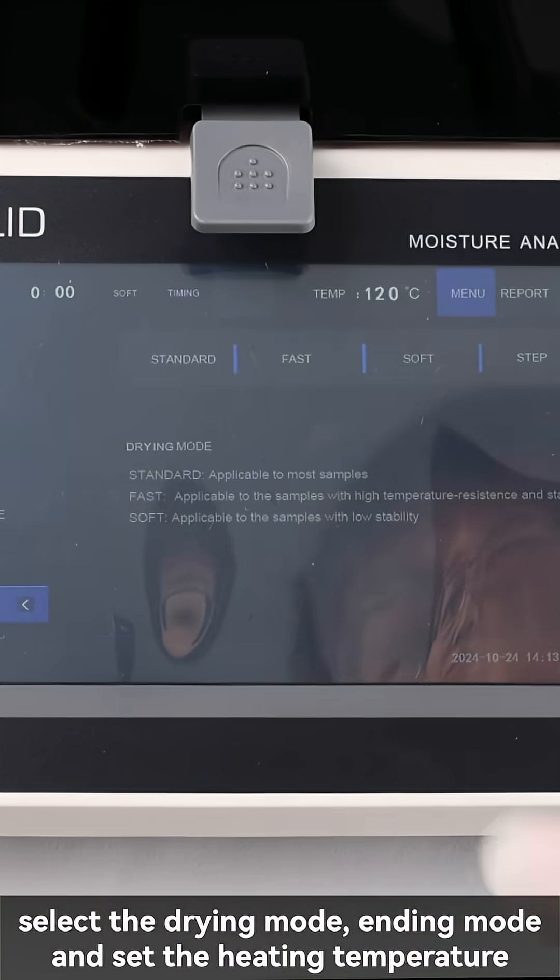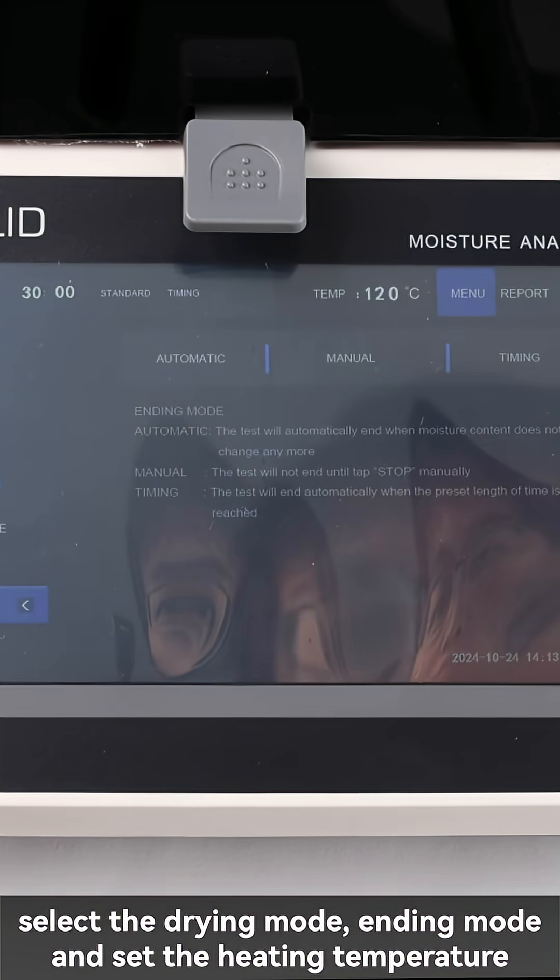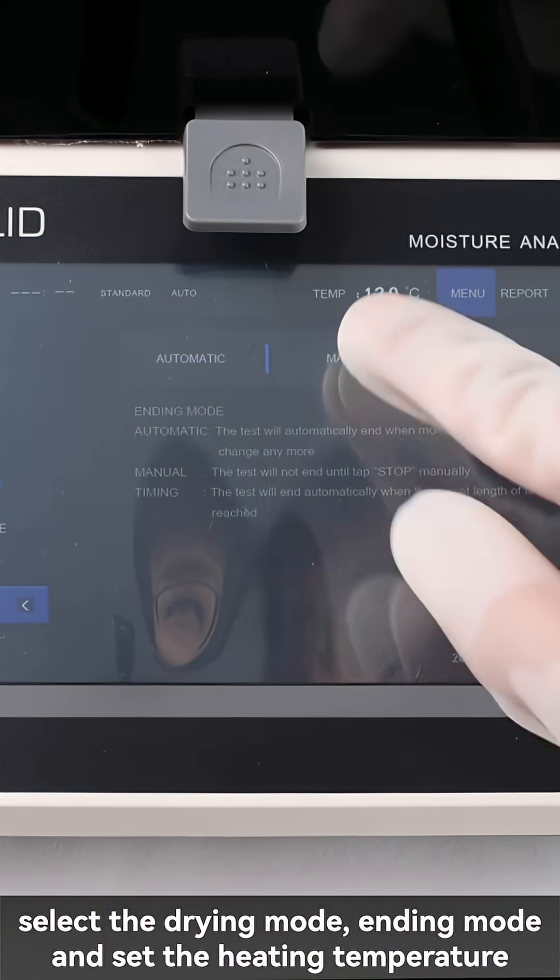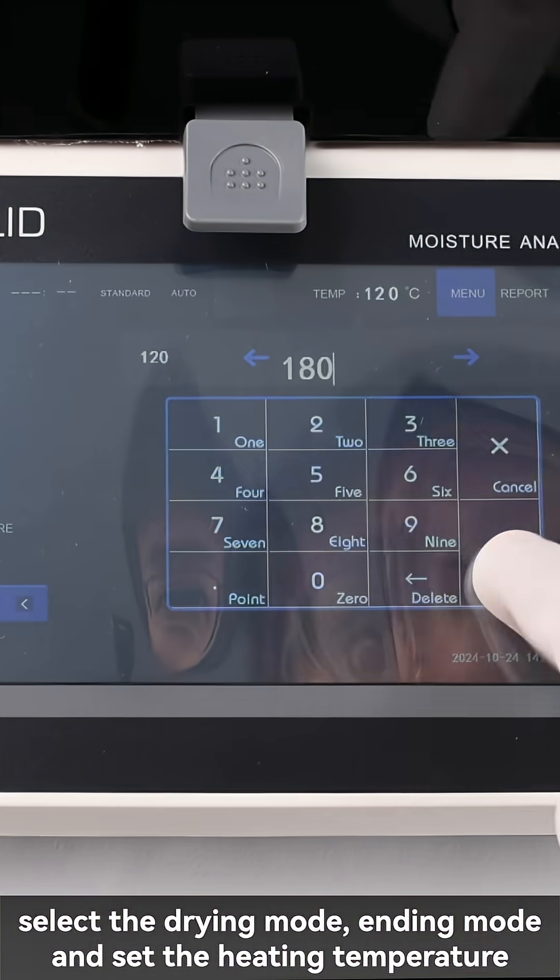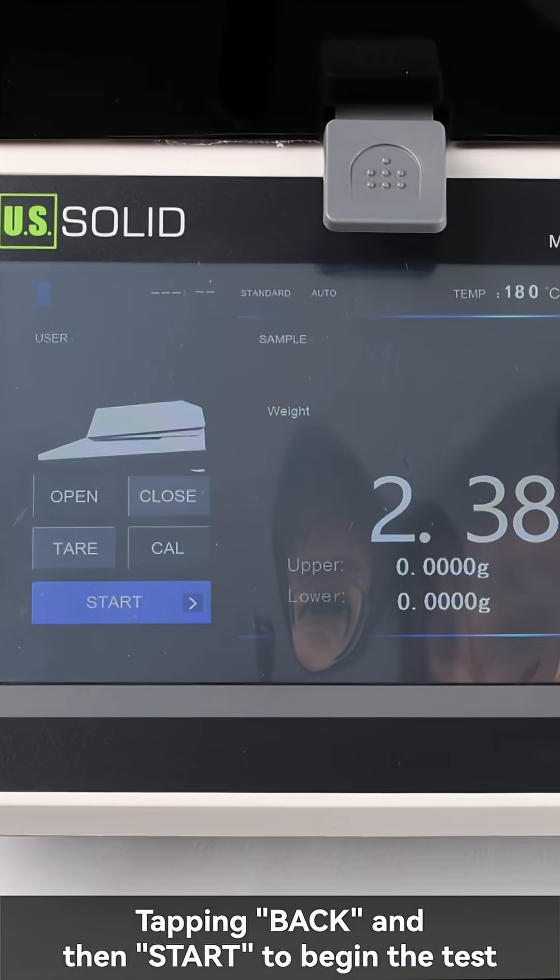Select the drying mode, ending mode, and set the heating temperature. Tap back and then start to begin the test.